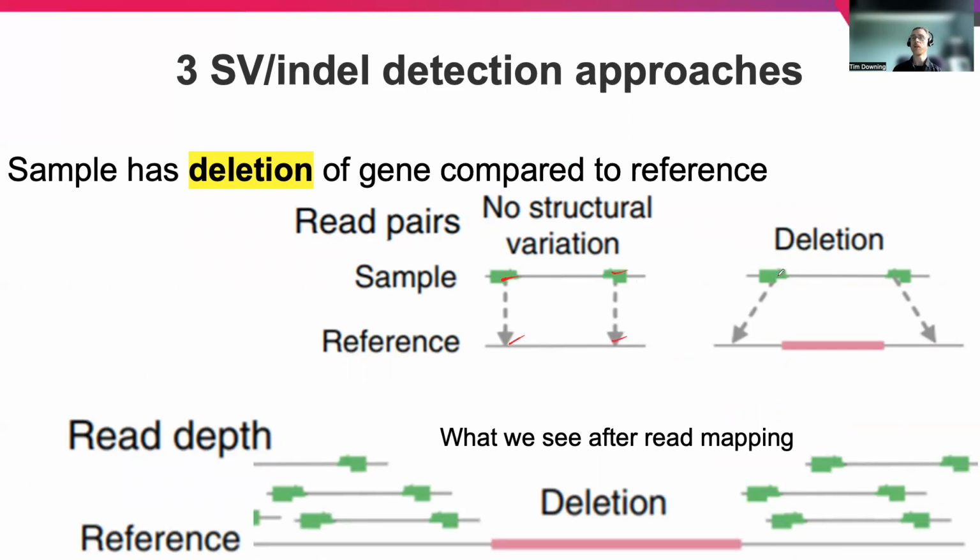If we get a deletion, then the region that's absent in our sample, maybe at this point, like there, like that. That'll mean that if this is a read pair, they're much farther away and have a longer insert size because of this gap. And we'll see then that we have this deletion where we have very little mapped. So that's the pattern that we would get.